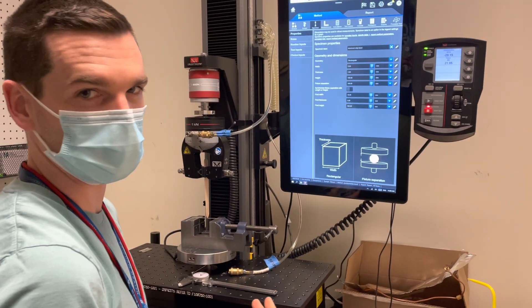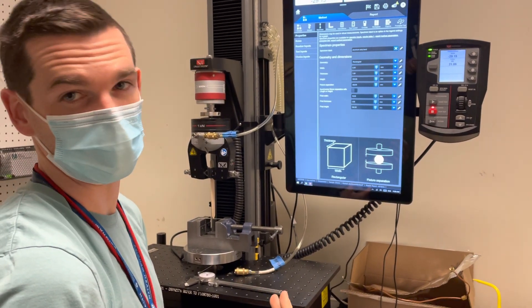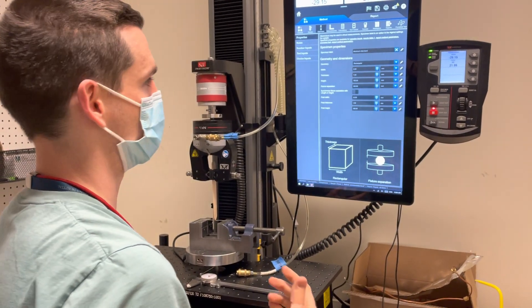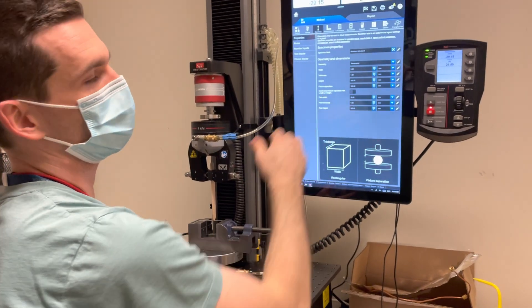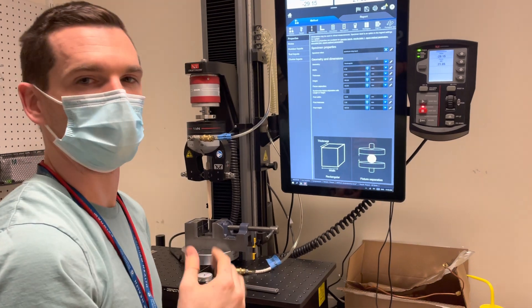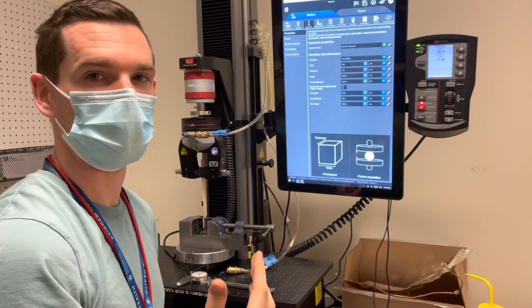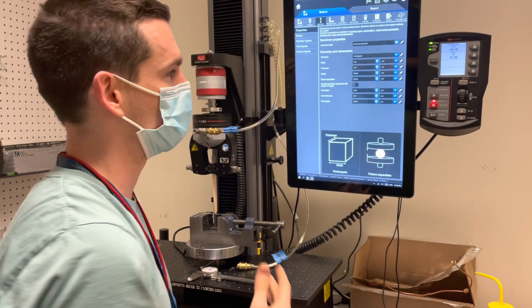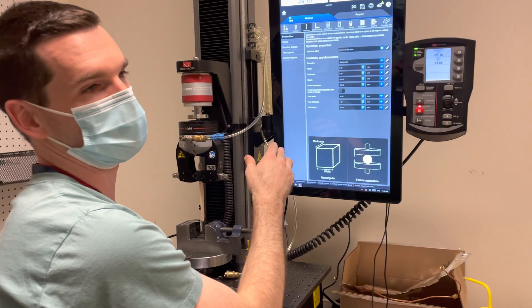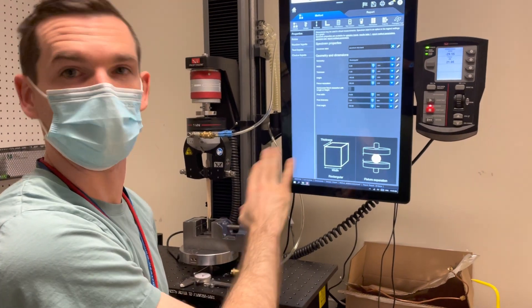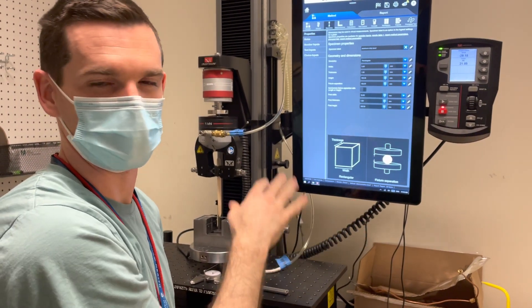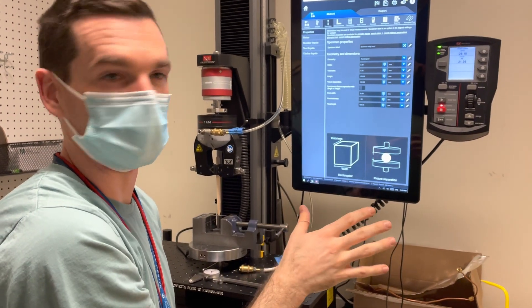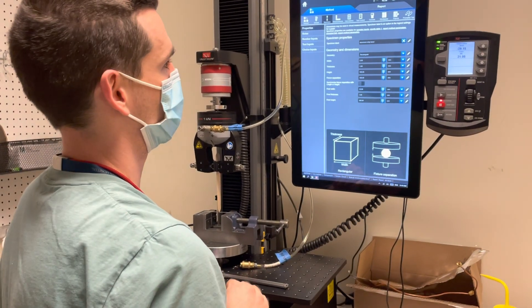You may have circles, you may have tubes — things like that. This is only important if you need to know the stress at the end of the test. If you're just doing load displacement, this doesn't factor into any of the results — you're just getting raw data out of it.